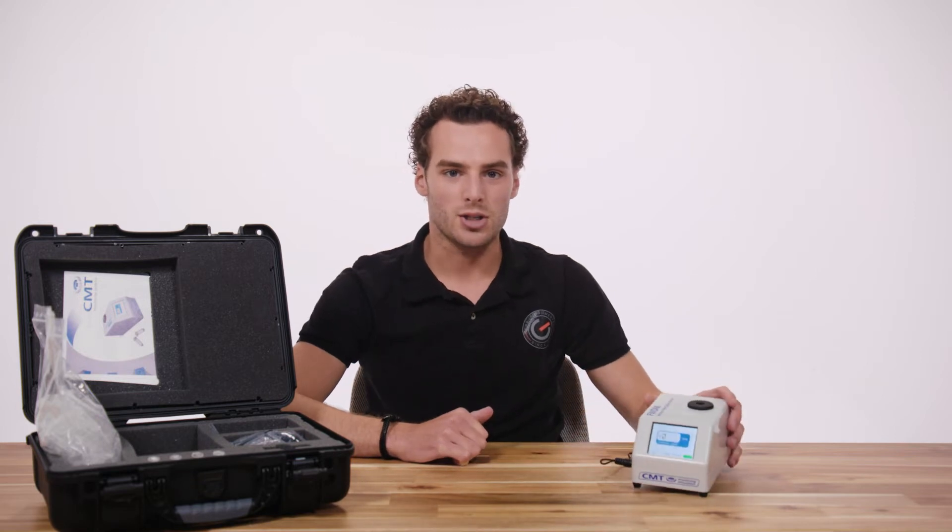How this device works is by creating an electromagnetic field in its sensing chamber that is highly sensitive to the presence of ferrous particles. As you insert a sample into the sensing chamber, the device automatically determines the concentration of ferrous particles in ppm, which is parts per million.